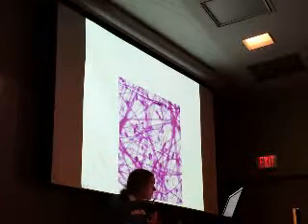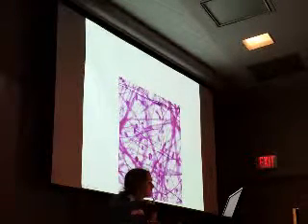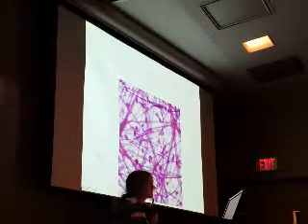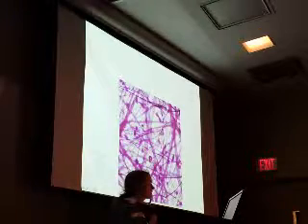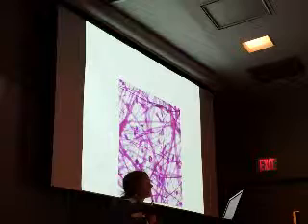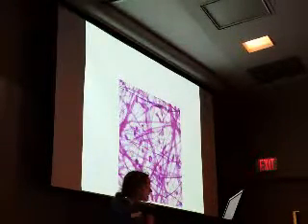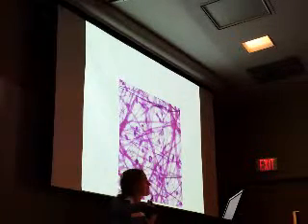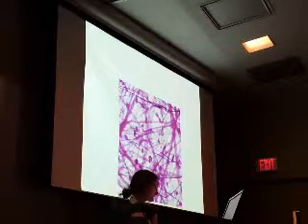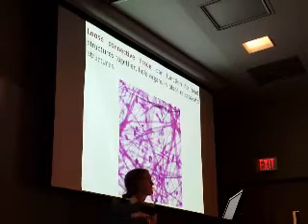So again, what's the feature that you see first? You see cell nuclei, right? But they're really far apart from each other, right? What kind of cells are these? There's a nucleus of what kind of cell? Anyone guess? Okay. The most abundant type of connective tissue cell is going to be the lowly fibroblasts. Okay, so they're fibroblasts. And this is an example of one of the seven types of connective tissue.